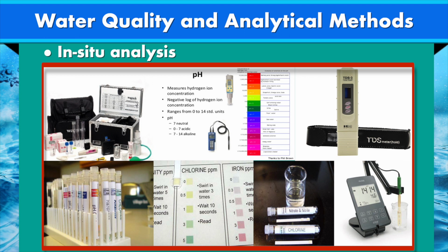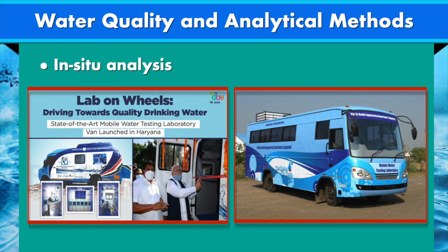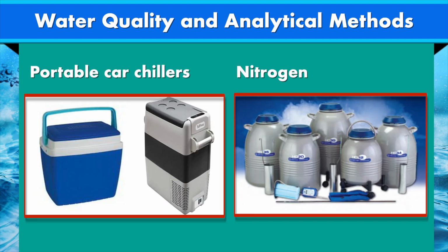Biological and temperature sensitive parameters such as nutrients and alkalinity are required to be determined within hours of sampling. These analyses can be carried out in a mobile laboratory. Some laboratories, however, measure these in a permanent laboratory within 7 days of sample collection.